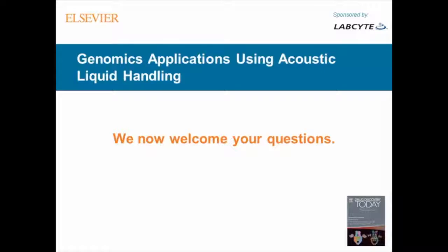I understand why the Echo cannot be used for magnetic bead cleanup steps. Are there other parts of the regular NGS workflow where the Echo cannot be used?